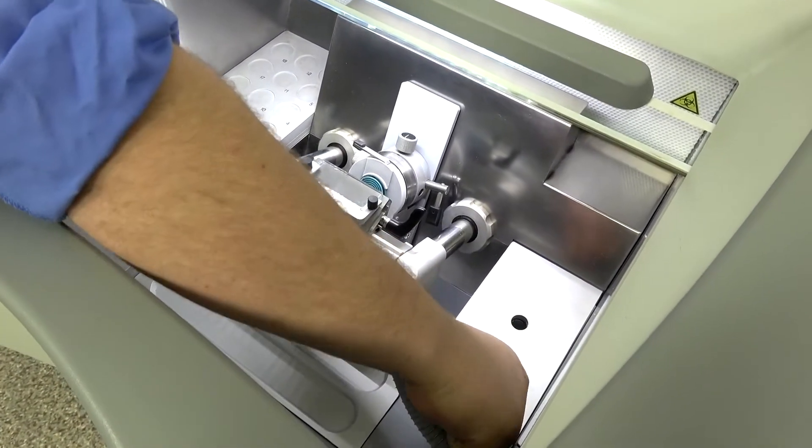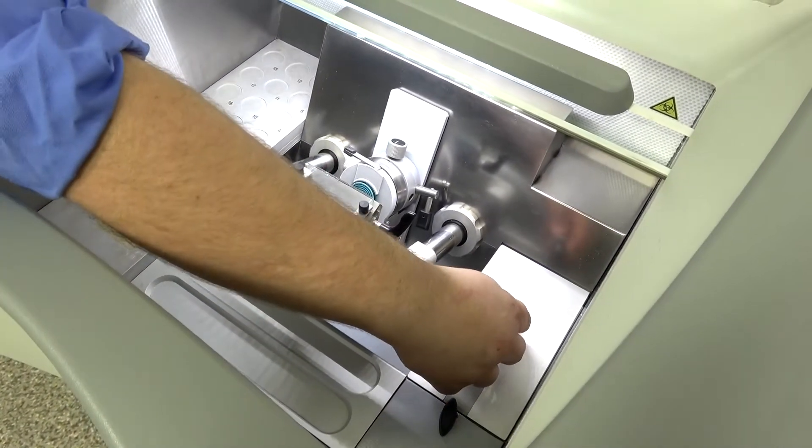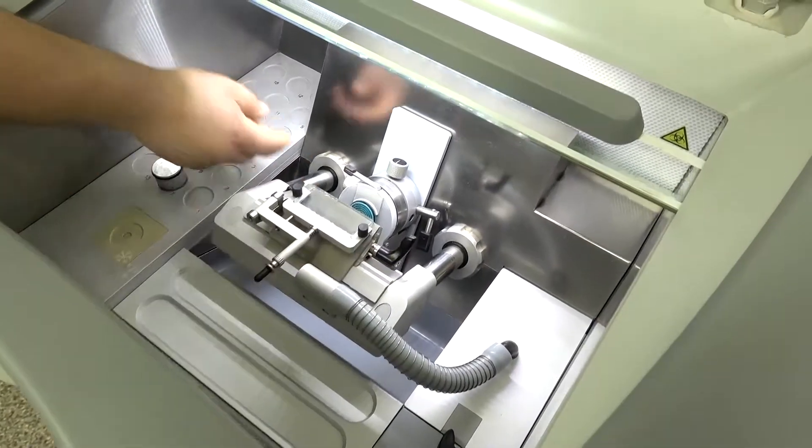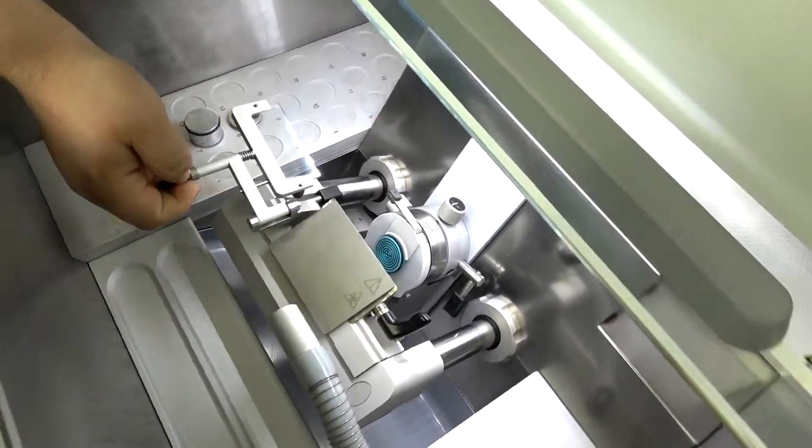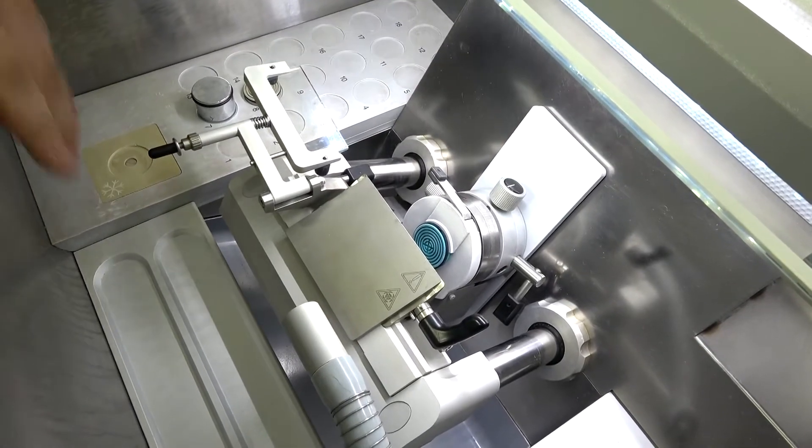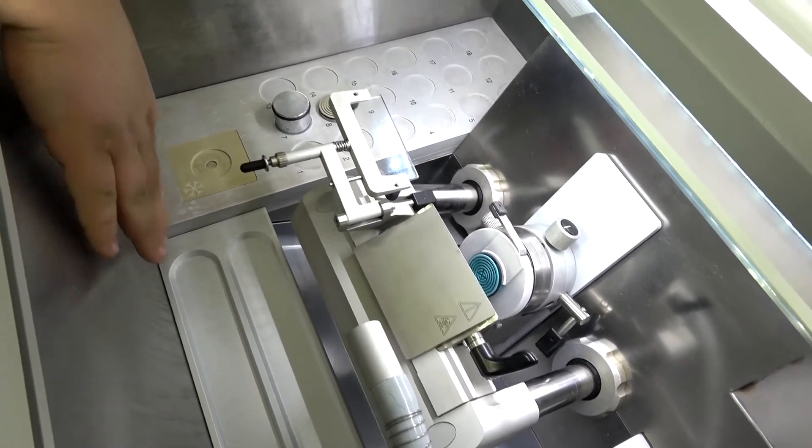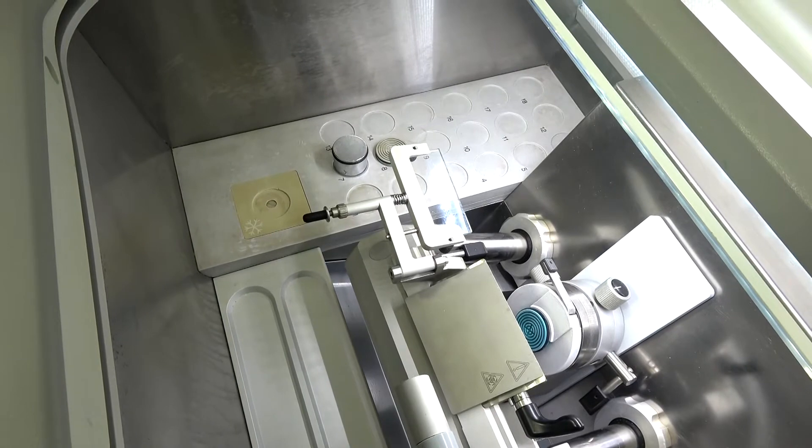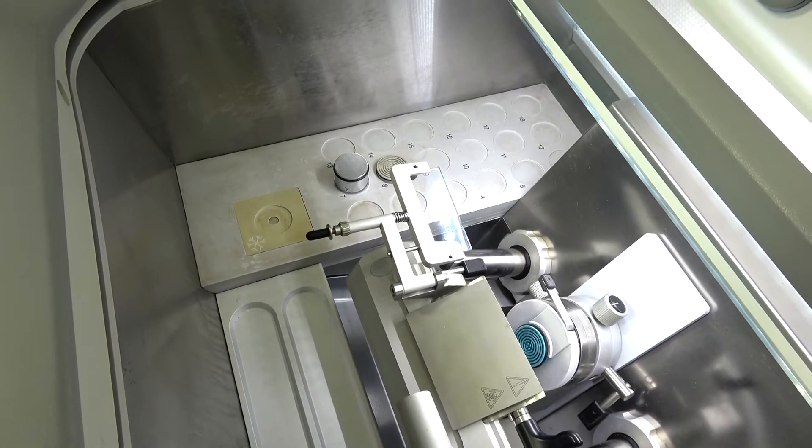While we're in the chamber, this unit comes with a cold knife and cold head so your knife is chilled along with your specimen head. This unit over here to the left has a cryo bar for all your chilling needs.